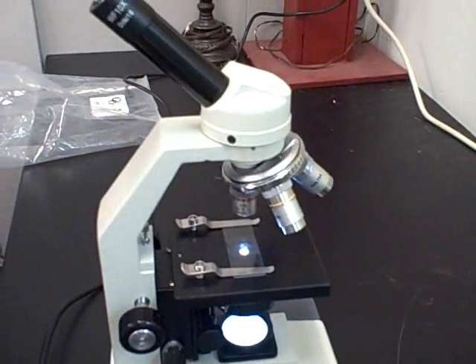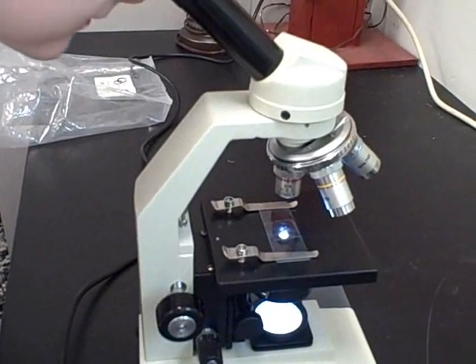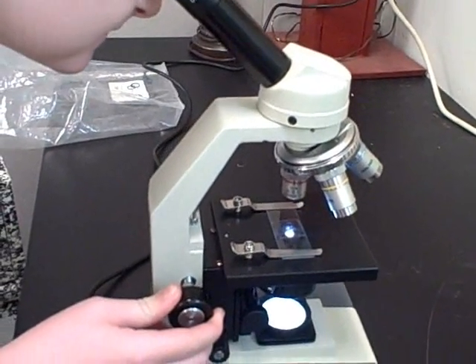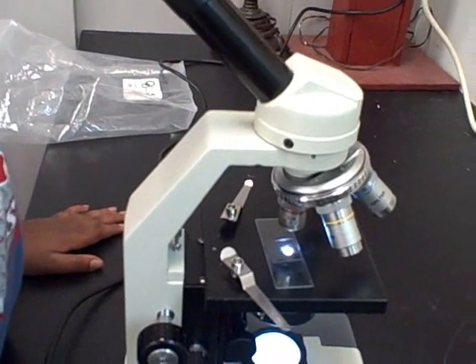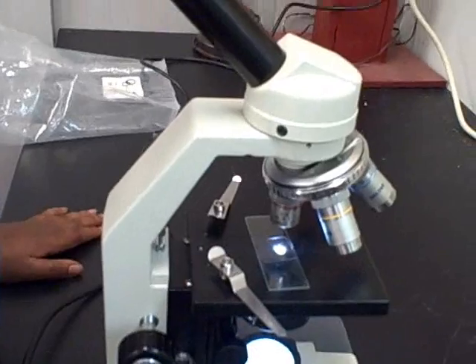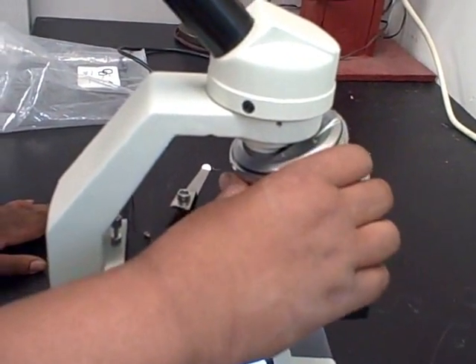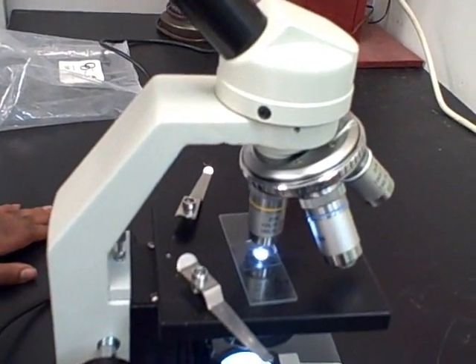Then you can look through the eyepiece and you can use the coarse focus to raise the stage. When you see something under low power and you want to zoom in, switch it to the 10x objective. Then you can zoom in on what you see.